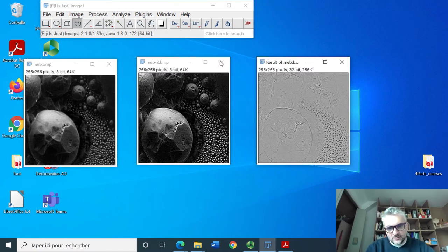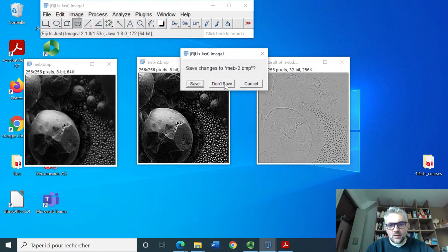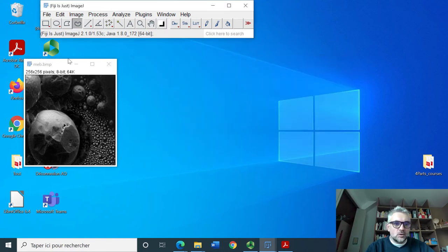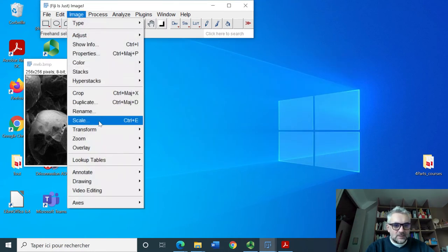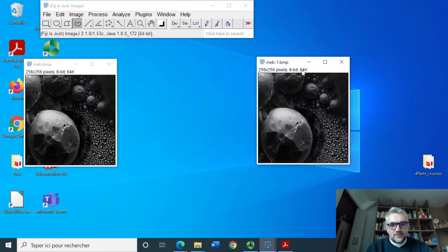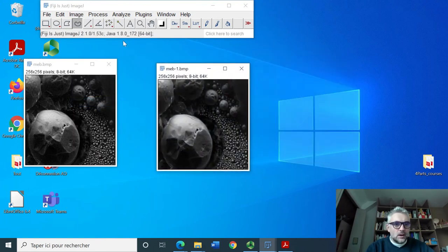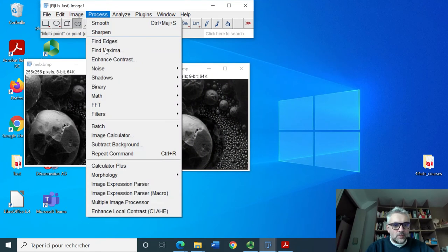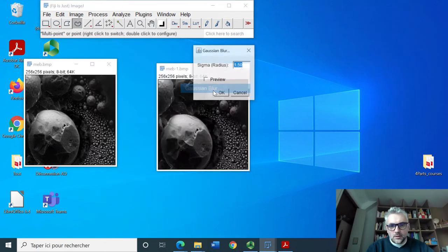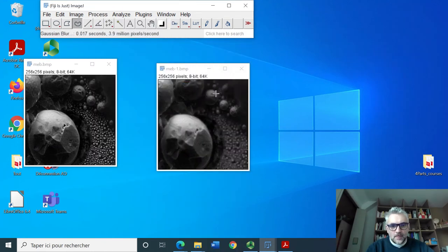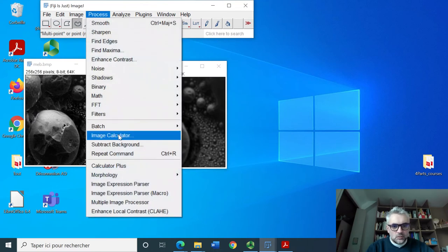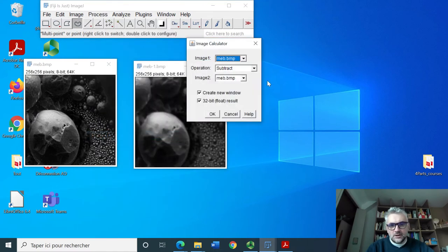Let's redo this with a smooth version. We duplicate it again and I will process it with a gaussian blur. If I do again a difference between the two images, this is what I got.